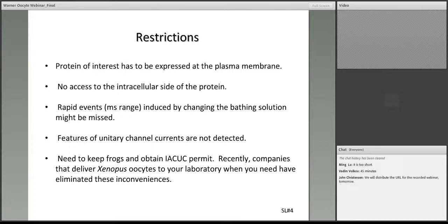Even this small but specific signal allows the isolation and cloning of the first pore-forming subunit of the channel. The example clearly illustrates the power of the technique. The other two subunits, beta and gamma, were cloned by complementing alpha ENaC with the original library. As shown in the right upper panel, addition of beta and gamma subunits to alpha ENaC increased the magnitude of the current by more than tenfold.